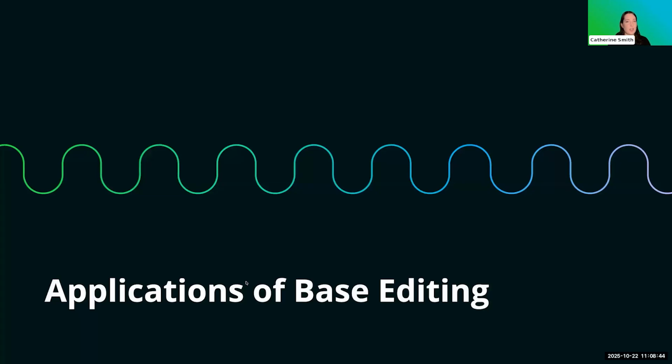Let's talk about how base editing could be used in your experiments. Here, I'm going to focus on some common edit types created using base editing and the high-level guide RNA design principles for achieving these edits.